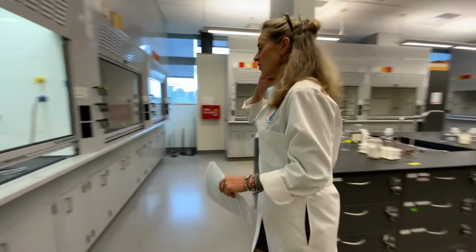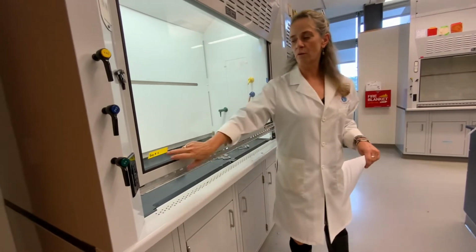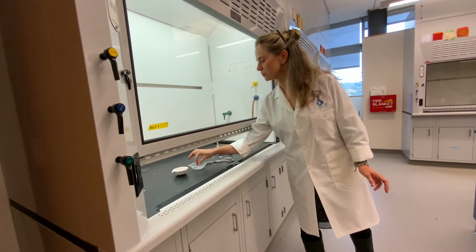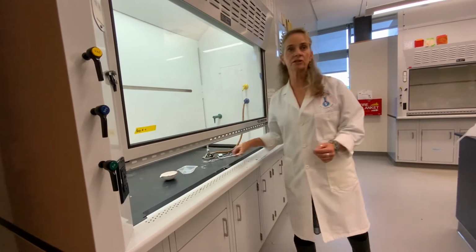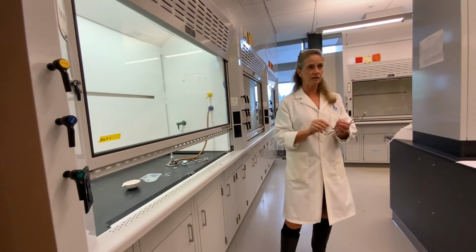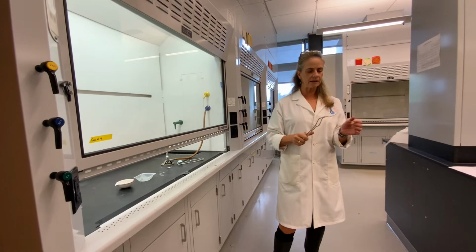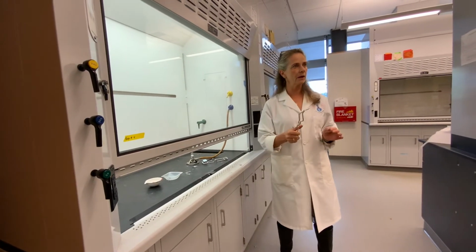All right, so over here, this is experiment number 4, and we're gonna actually take a piece of magnesium ribbon, which we will use again later on in a different capacity. These are tongs, and you guys haven't used these yet, so I'm trying to point out the stuff you haven't used. You're gonna hold that magnesium strip with the tongs. You're gonna light the Bunsen burner as you know how, okay?